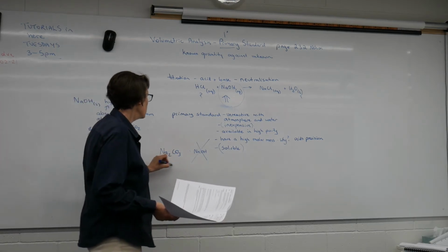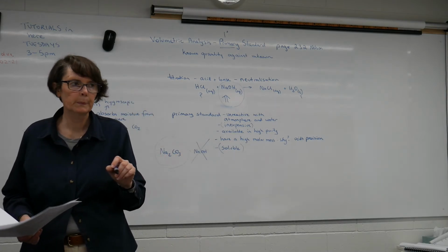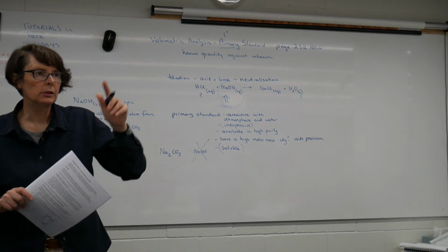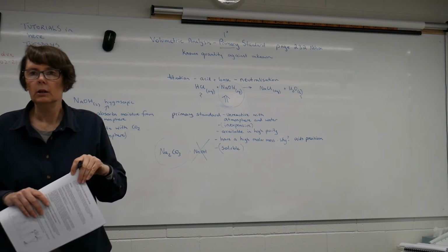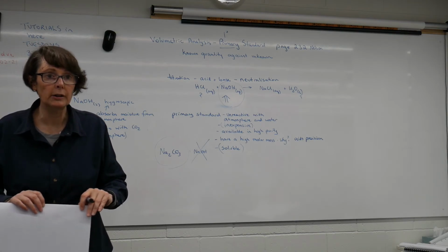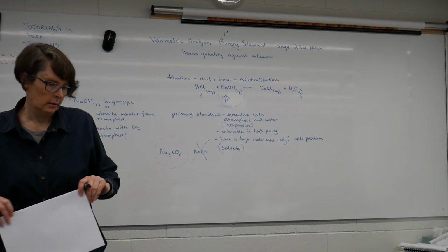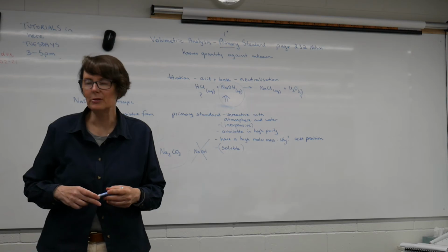So your first task will be to make up your primary standard solution, and our gear is just in the tubs in the back corner over there next to the pass-through. Does everyone remember titrating? Did people titrate last year? Yeah. Kept overshooting. Well, that's a common thing to do.